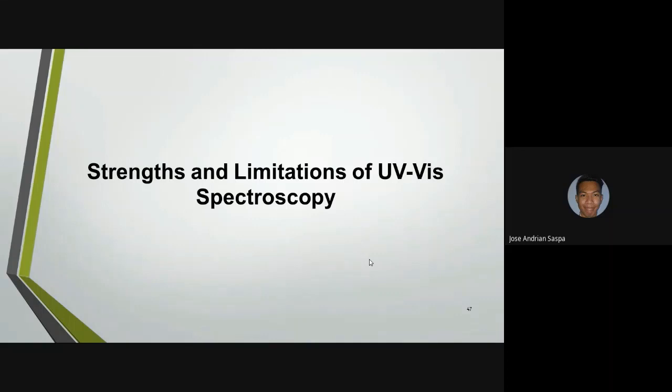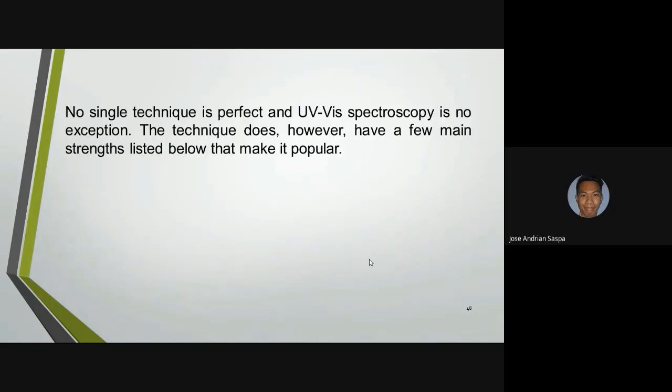So, strengths and limitations of UV-vis spectroscopy. No single technique is perfect, and UV-vis spectroscopy is no exception. The technique does, however, have a few main strengths listed below that make it popular. The same as with other instruments, UV-vis spectroscopy also has flaws.